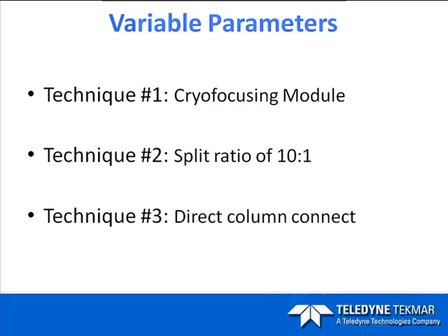The whole idea behind cryofocusing is that the analytes are supposed to collect in a more tight band, improving the sensitivity. Originally, when we started this project, we thought that cryofocusing was the only way that we were going to be able to get down to the 1 part per trillion levels. And then we decided, once we looked at it and started to see some of the results, to move forward and try these other 2 techniques as well and see what kind of response we can get.